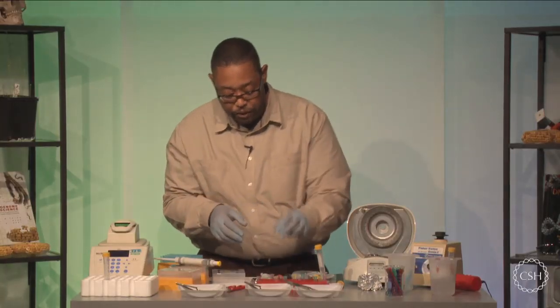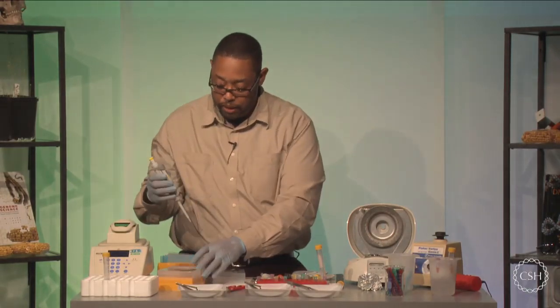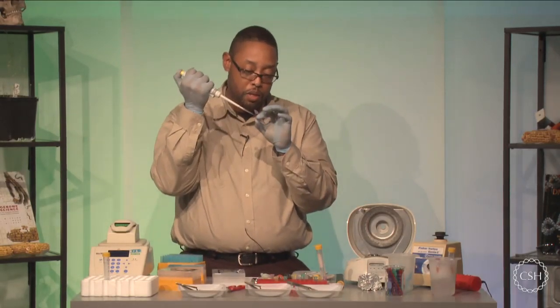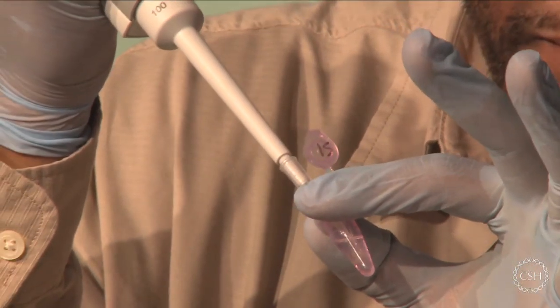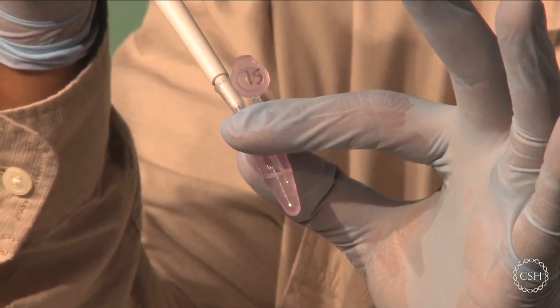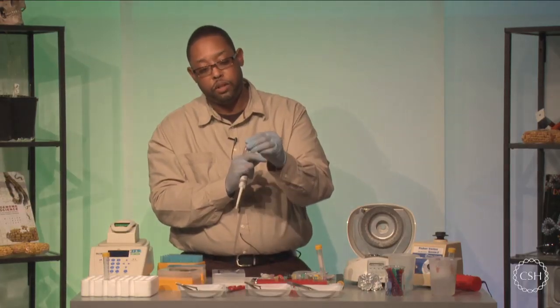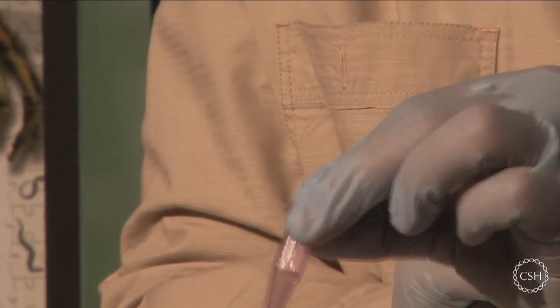Okay. The last thing that you can physically try to do is to take a P100 set to 100 microliters, and we can try to physically get down in there and pipette the pellet up and down. So I'm going to go in here with my pipetter, and all I'm going to do is draw up the silica resin and pipette it back and forth. And here you can see that I'm actually breaking up the silica resin pellet once again, and it's distributing throughout the liquid here. And this is good because we're getting good washing all the way across. So you can also invert a few times to make sure that you're getting a good mixture after that type of wash. Okay.